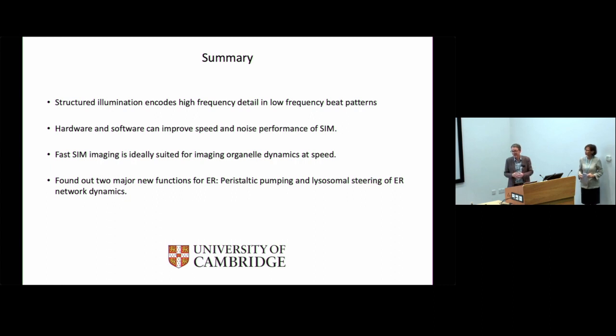We're limited, in fact, by the camera technology at the moment. This trick goes quickly, but then you need to also put a lot of light onto the samples, and then the question is whether the samples like that. So the light dosage is a really important thing, and that's where these algorithms come in. So we try and put the light dosage down, get lower quality images, but perform better reconstruction. So it's essentially exactly that game we have to play: resolution, speed, quality of the images, survival.